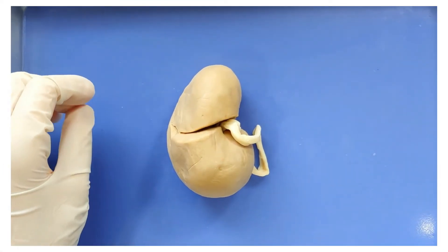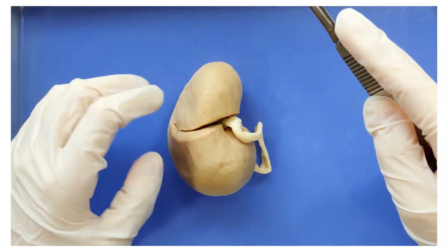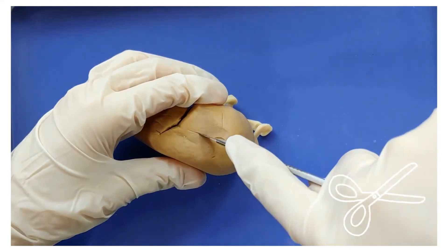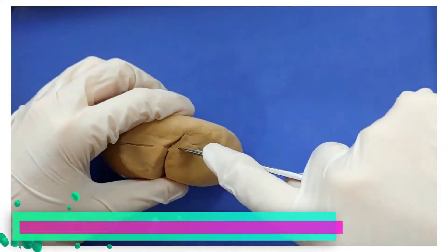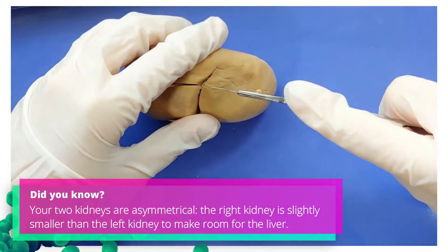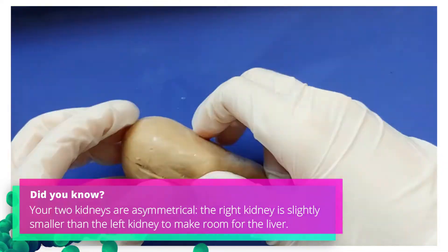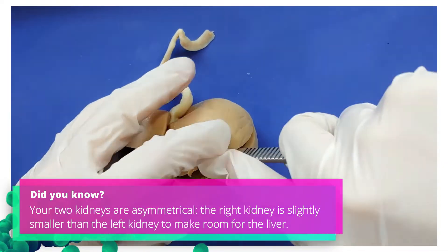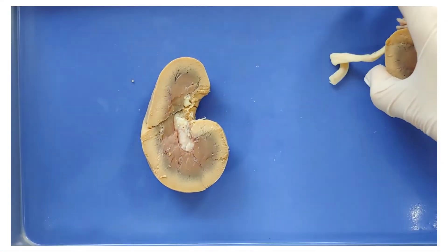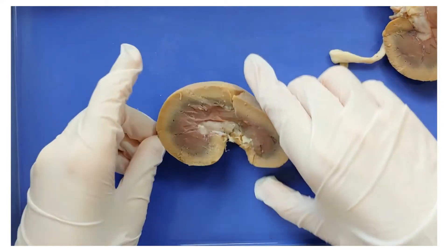Now let's take a look at the internal anatomy. I'm going to take a scalpel and cut it in half like this — just cut all the way around in multiple strokes. Now you can open it up like a book. I'm going to move one half away and we'll just look at this half.